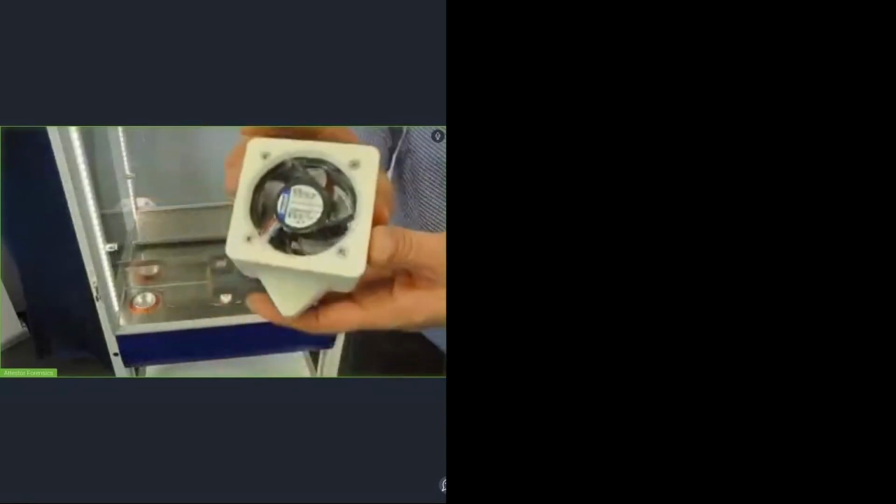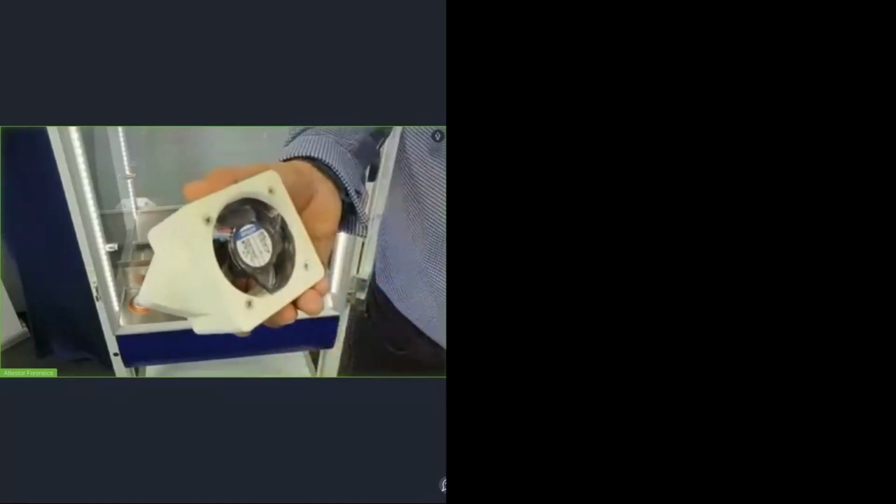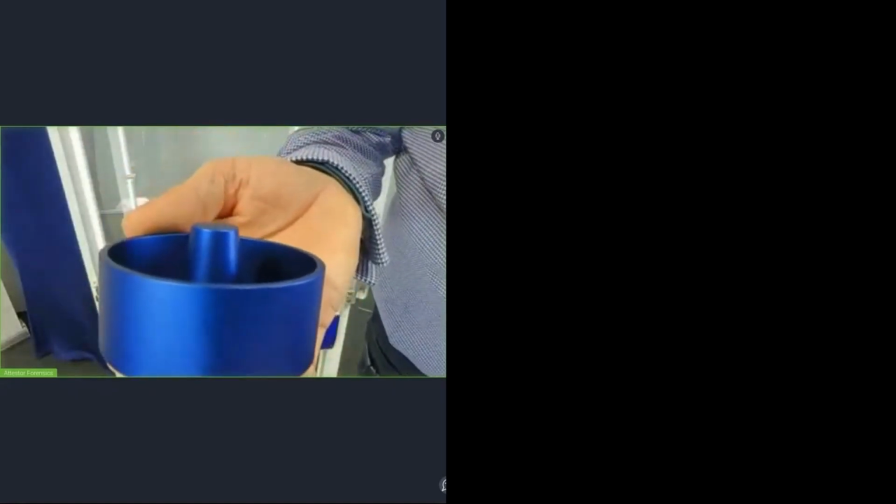Or if you have technical skills enough, you take those 4 screws off and you mount a new fan in there yourself, because the plastic material around it, the housing, is obviously still working. Then on the right side here, that is the glue dish. No, sorry, the humidifier tank. This is made from anodized aluminum, and also that one is not a new one. That has many fumings done, and as long as you don't put it into the dishwasher, it really is easy to clean. And then in the end, you see my air guiding baffle.